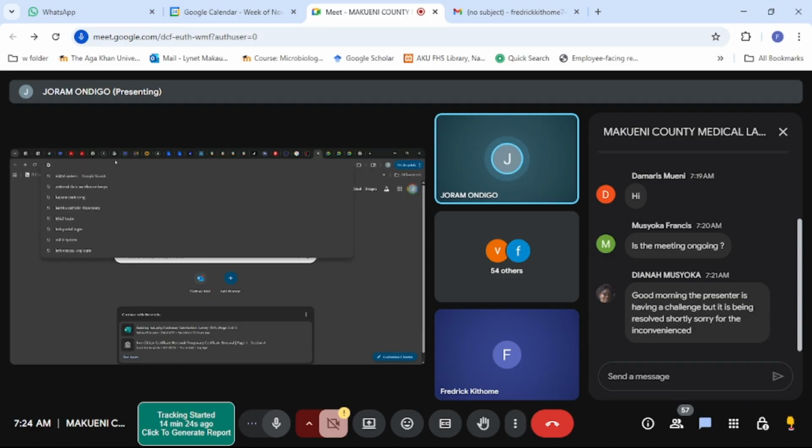One, you have to know the URL you're supposed to use. So I'll take you through a live demonstration of the system. So anybody who has got a computer around can actually just follow. So there's this thing called EID/VL system.